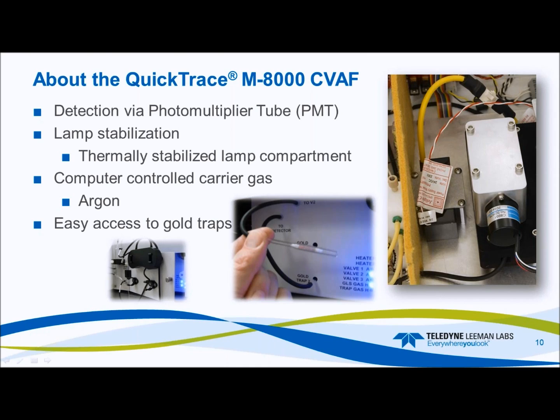So it's basically you open the front door, and then from the front door you can grab the gold trap and pop it out, and you can exchange it and/or inspect it before you start the system up.